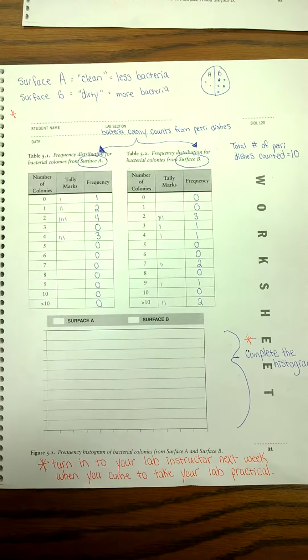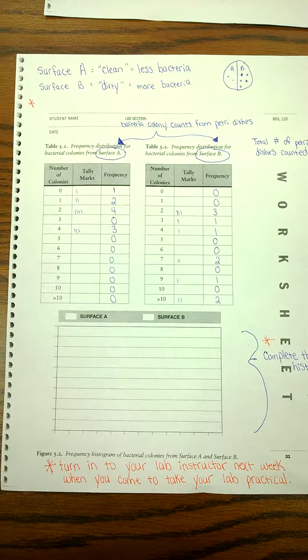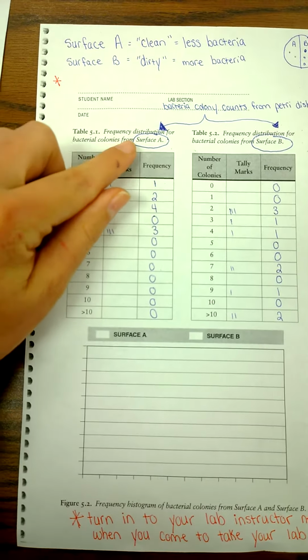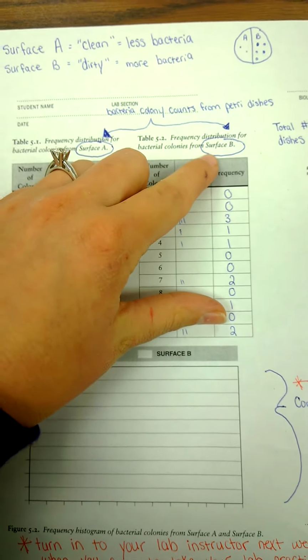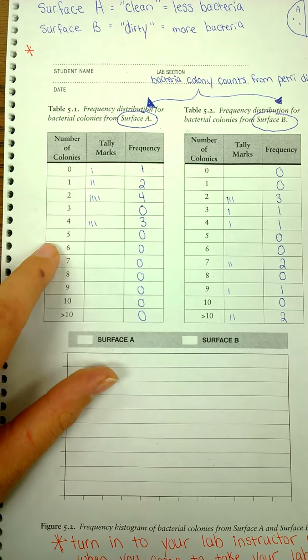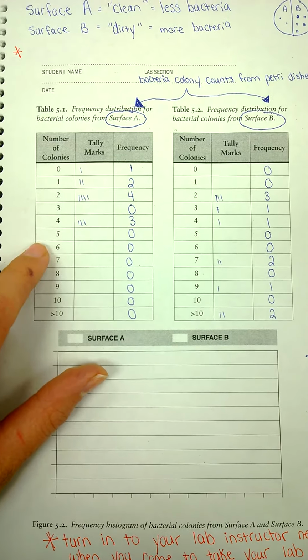Your worksheet on page 31 has two tables that you will need to complete. You have a table for surface A. You also have a table for surface B. In each table, we recorded the frequency of the colonies in our petri dish.